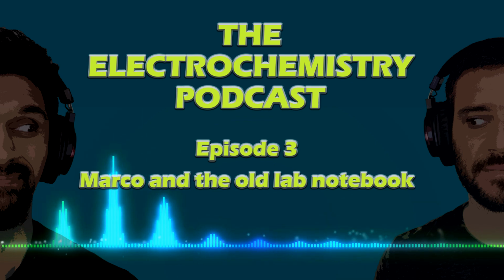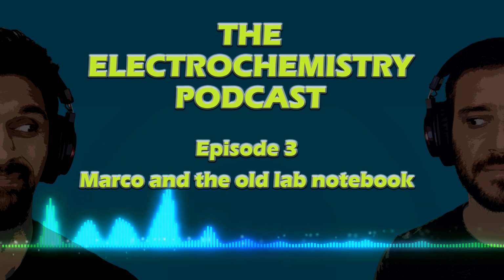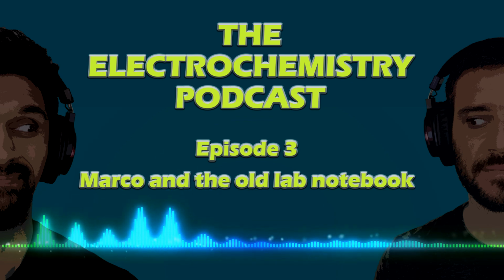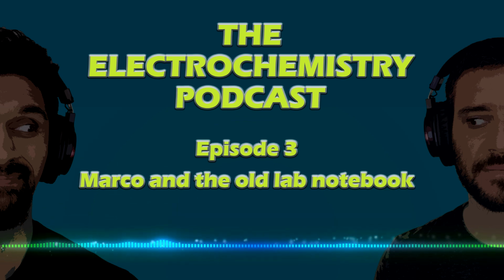So if you remember earlier, we were talking about the counter electrode and the equal and opposite stuff. So basically the point that I think Alex made earlier was that the counter electrode has the equal and opposite current of the working electrode. That does not necessarily mean that the counter electrode has the equal and opposite potential of the working electrode. That's correct. And this is an interesting result of having a 3-electrode system.